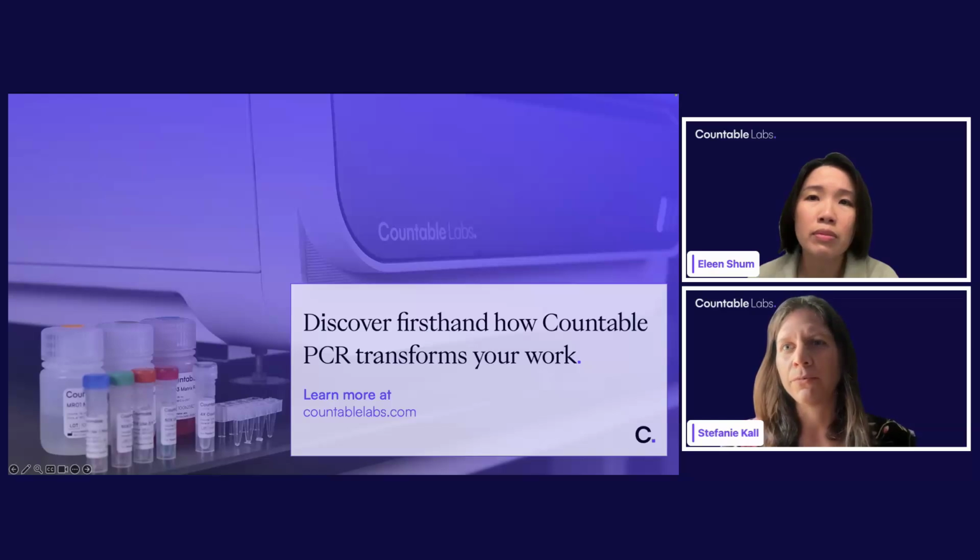On the low end, we don't recommend much lower than about 1 nanogram. And on the volume side, it's whatever you dilute it out to, so on the low side it's up to you.